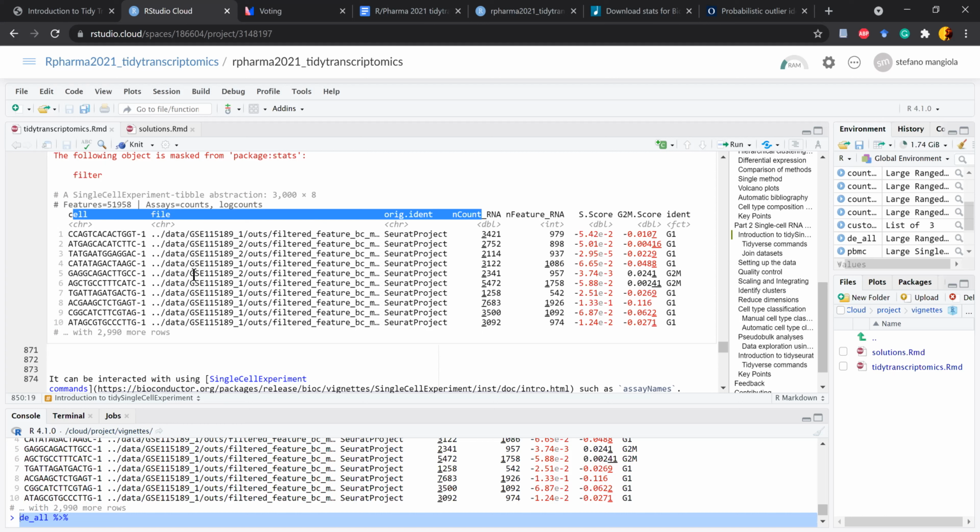This information includes cell metadata, but also reduced dimensions and all sorts of cell-related information. If we choose, we can use join_transcripts, as I will show you later, to join transcript information in this representation as well, to do calculations, visualization, and so on.